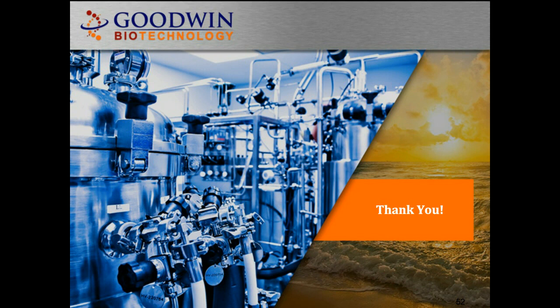Now, I'll be honest, a lot of our business as well is moving more away from chemical sterilization. We can still do that, but due to the safety concerns, I'm seeing an increase in autoclave and irradiation sterilization.